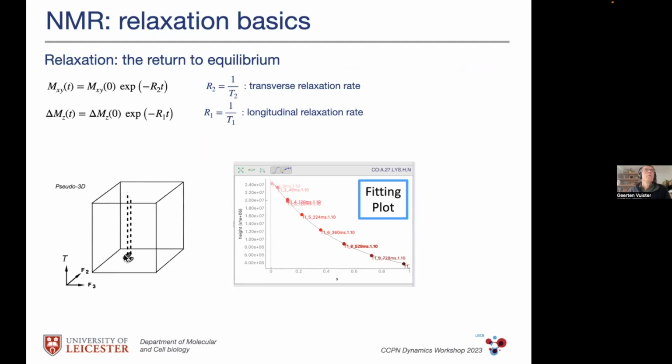So just to give you an example, here's the same figure again, t here, and here is the decay that we then measure of such a signal. And actually this comes straight from the tutorial manual. And it doesn't make any difference whether we are looking at R1s or R2s, because those are just exponential decay curves that we're interested in examining.